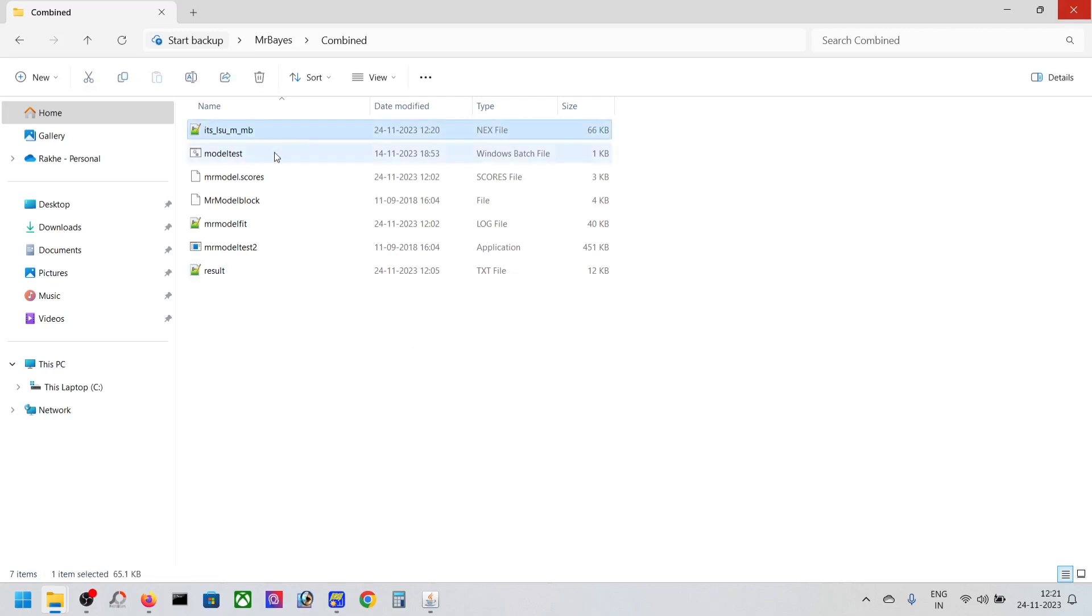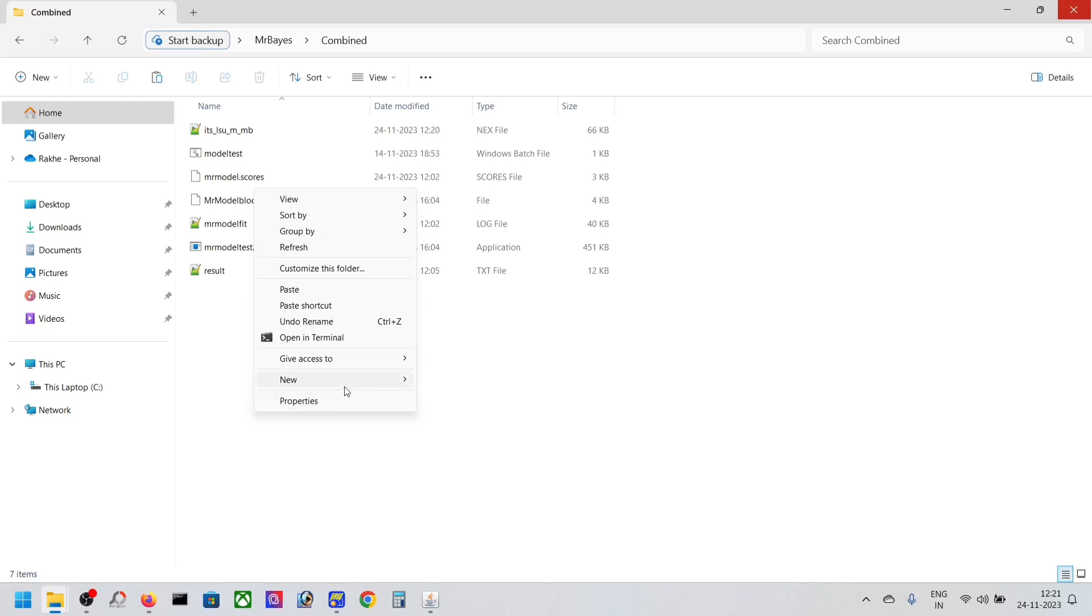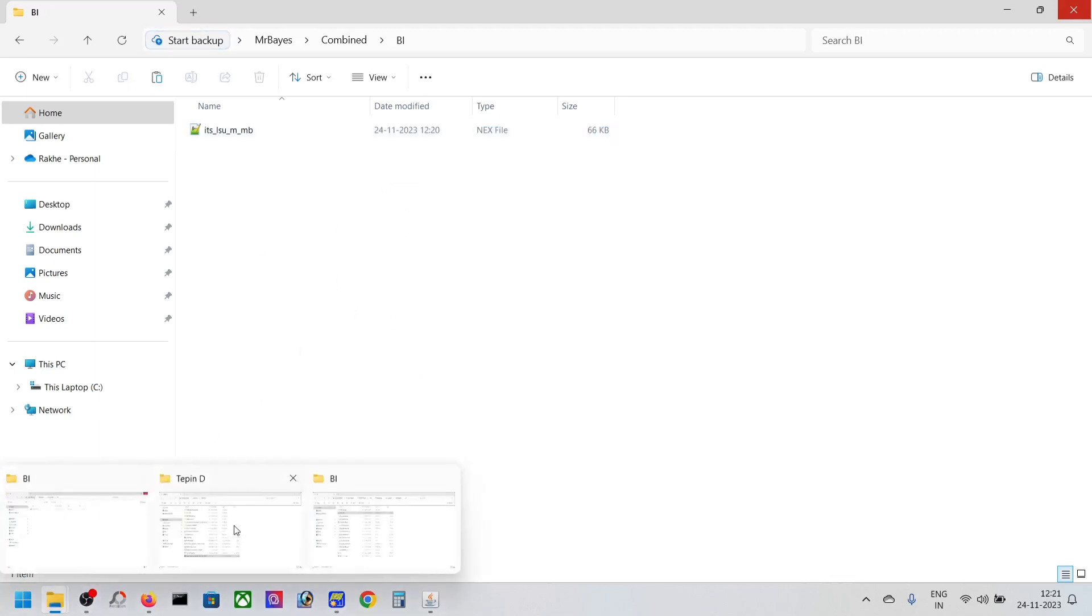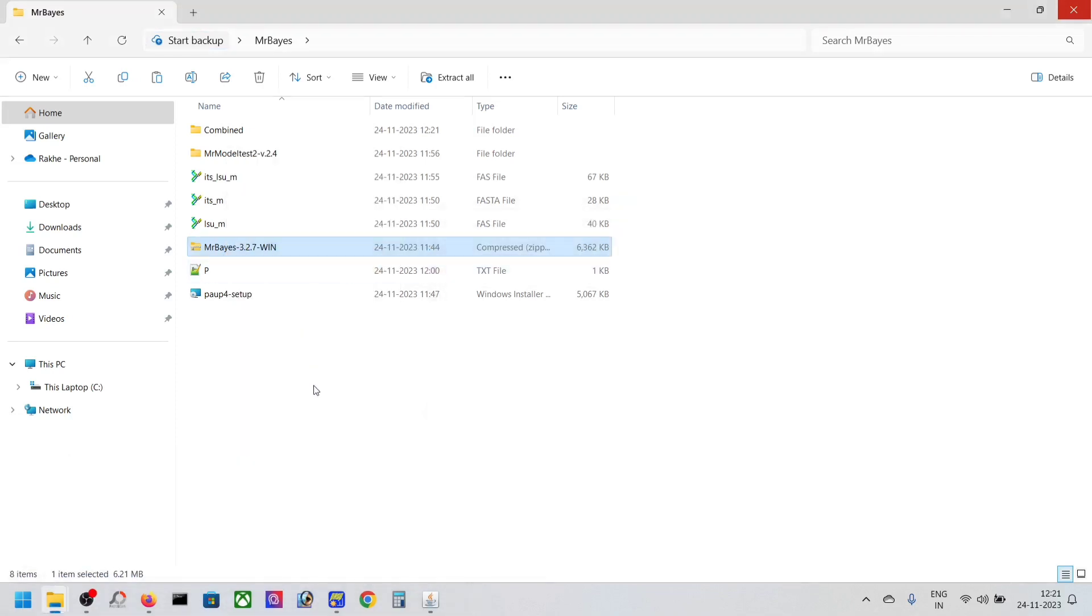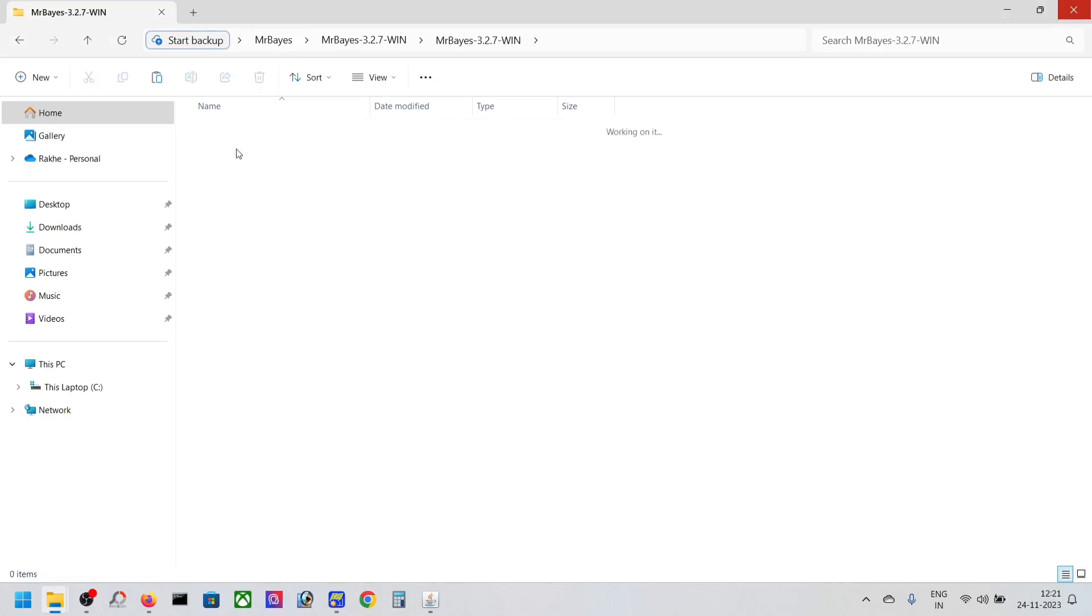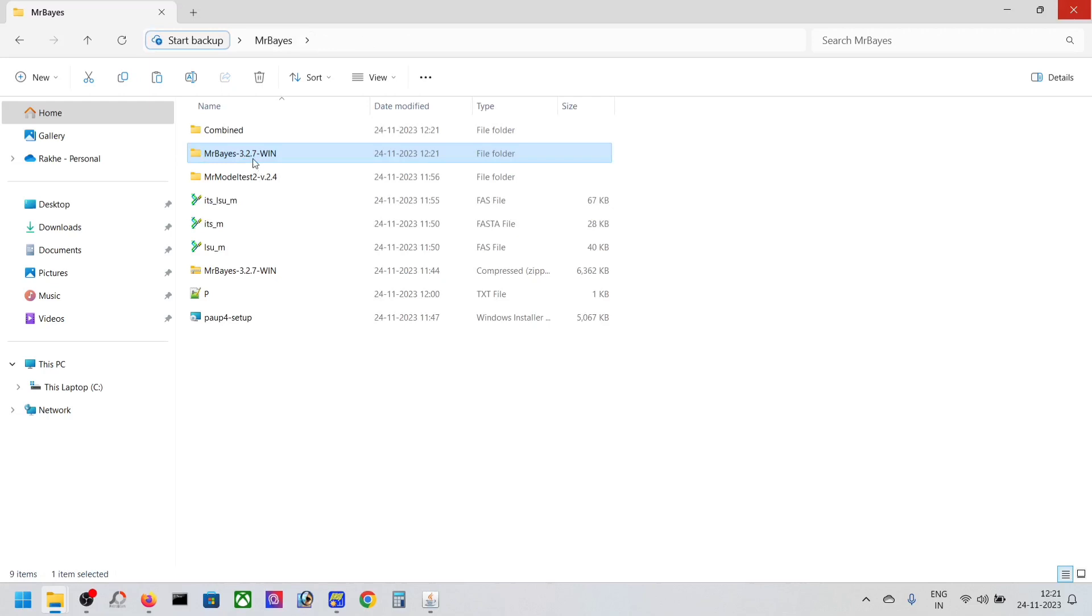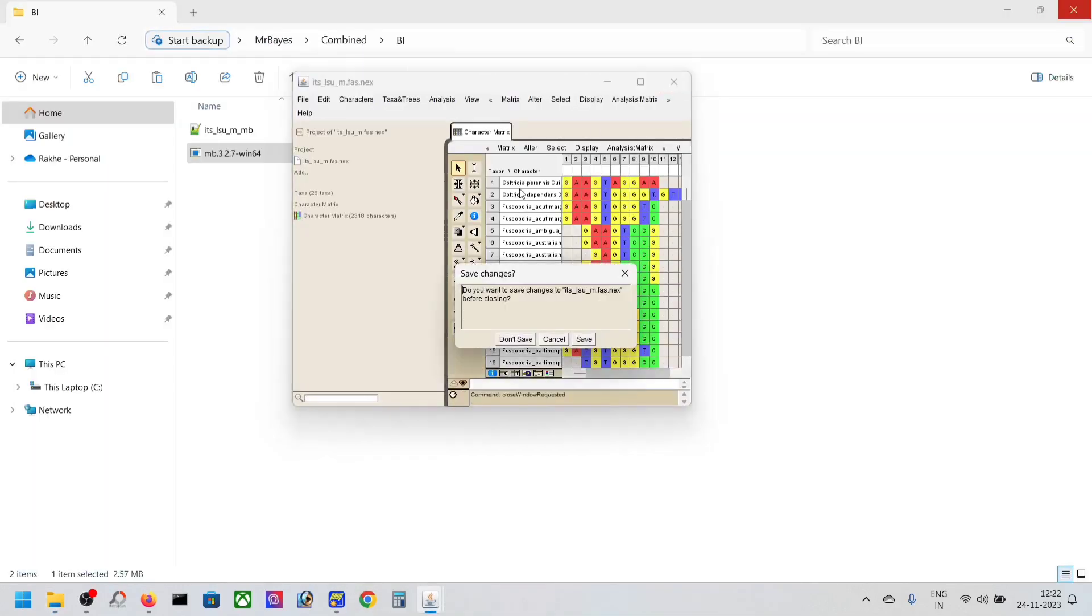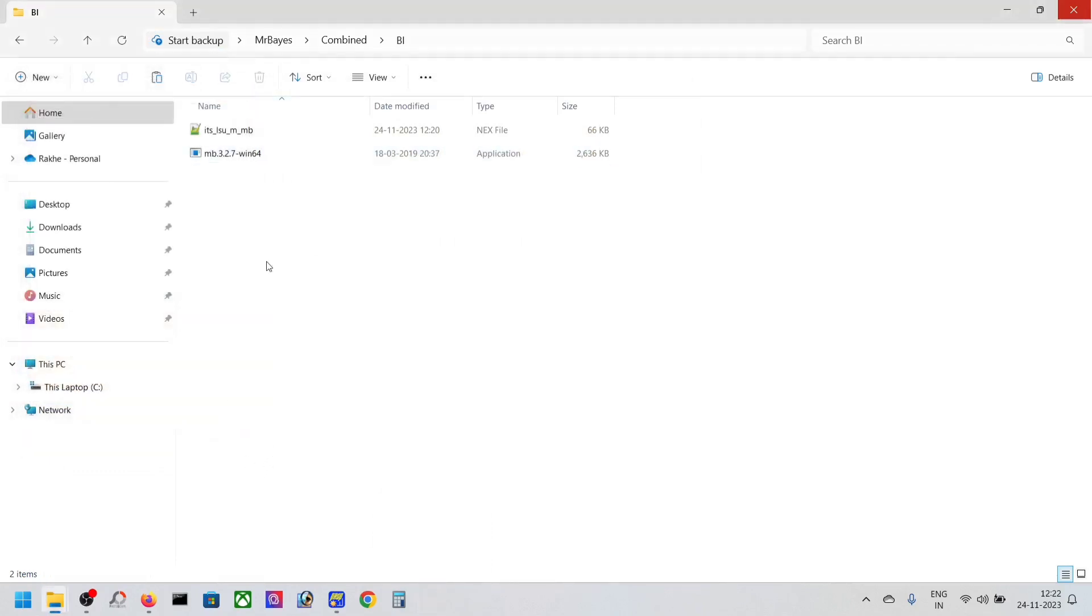Paste it here. Now we're going to take our MrBayes Windows version and extract it. In the bin file, take the 64-bit version and paste it here. Close this and now open this one.